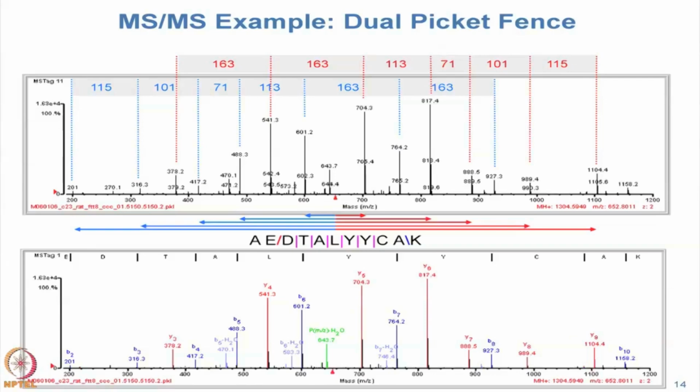Okay, all right, so what I'm trying to show you here is that there's a lot of information, okay? If we have a complete interpretation of the sequence, it would be shown here, okay? The way I have slashes between the amino acids is to indicate that there's fragmentation. This red slash indicates that there was only a Y ion there, okay?